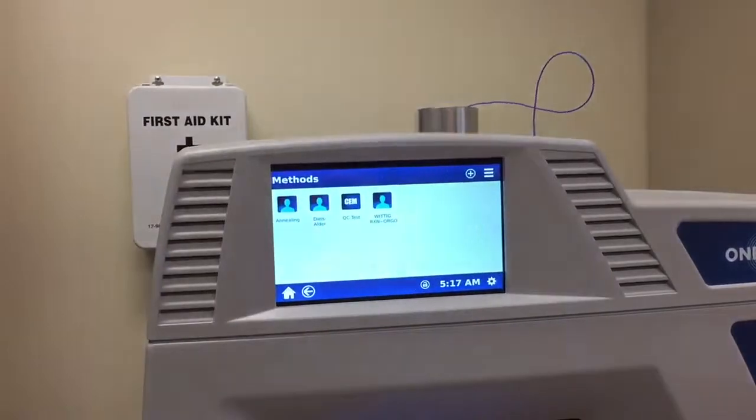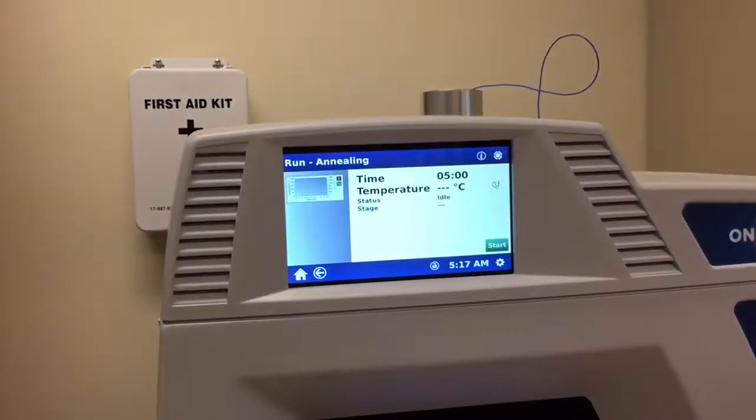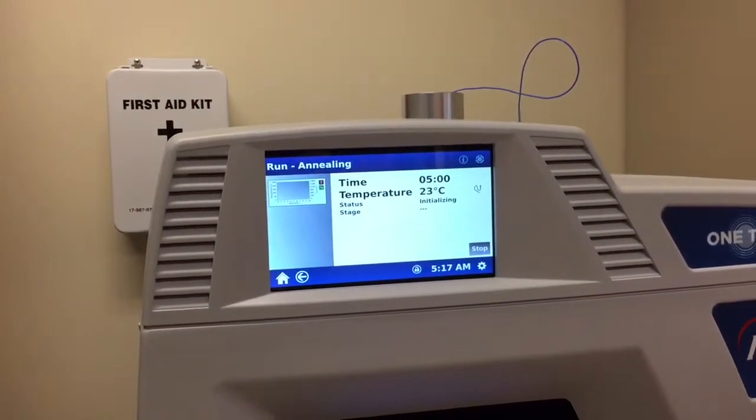Choose classic methods and select the appropriate reaction method. Press start to start the reaction.